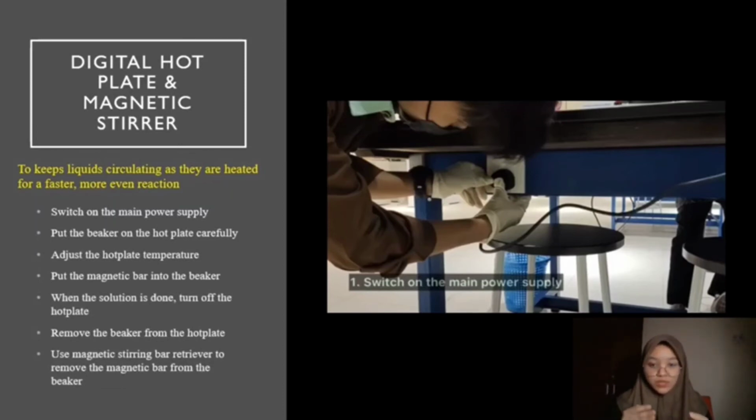So how to use this equipment? Okay, firstly, switch on the main power supply. Put the beaker on the hot plate carefully. Adjust the hot plate temperature. And next, put the magnetic bar into the beaker so that the magnetic bar will keep stirring the solution in the beaker.